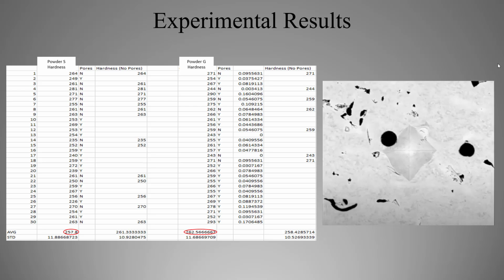Mostly the shape is symmetrical, depending on the material. Sometimes it can skew, causing one of the lengths to be longer than the other. The lengths are measured from point to point both ways. Using the Vickers hardness calculator, an average of the two lengths is calculated, called the Vickers hardness value. These values don't have any unit as such.